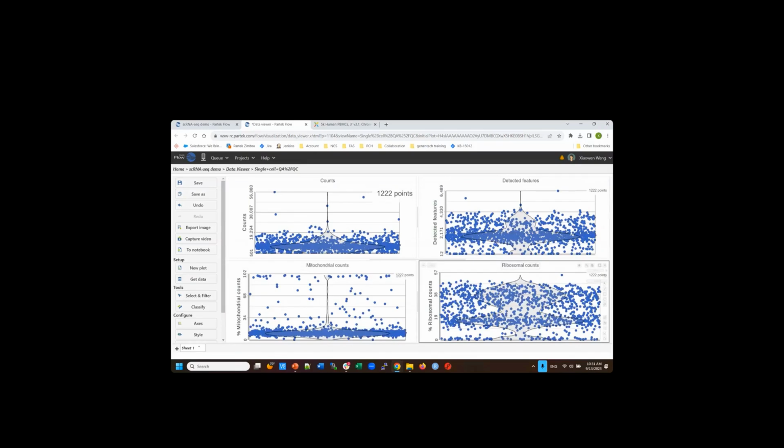When you filter your cells, statistics basically is filtering, right? So when you filter cells, always look at the feedback. There's no gold standard cutoff. Any cutoff is going to be subject to your data. So use your common knowledge based on your biology expertise and what study you're doing, and remove cells you think are really not good.